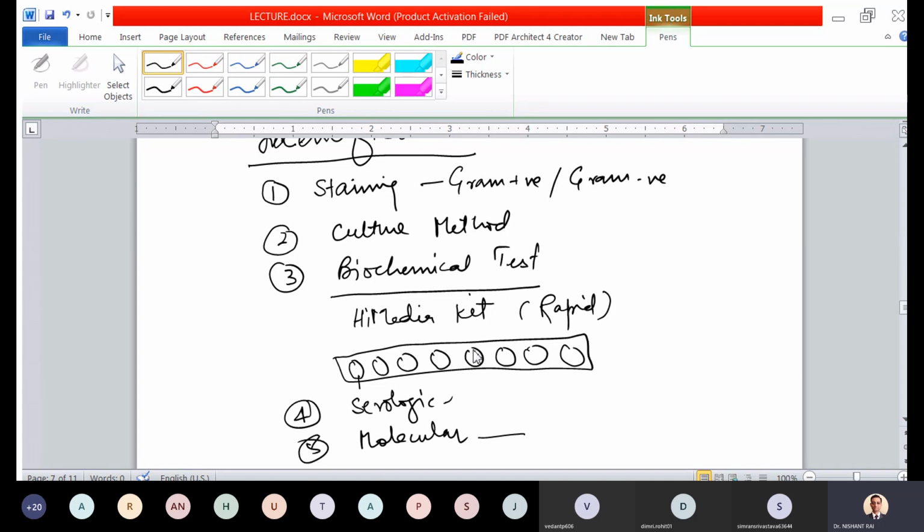अगर मैं कहूँ कि ग्रोथ को आइडेंटिफाई करें और डिफाइन करें या डिमॉन्स्ट्रेट करें, आप बताइए कि ग्रोथ हो रही है नहीं हो रही. आप सैंपल को लेंगे, इसको इनोकुलेट करेंगे, इंक्यूबेट करेंगे, राइट? और उसका ग्रो करेंगे. अब आप ये देखेंगे क्या बैक्टीरिया ग्रो कर रहा है, यानी कि बैक्टीरिया वायबल है. और फिर नंबर ऑफ कॉलोनीज कितनी है. तो दिस इज बेसिकली इनडायरेक्ट मेथड ऑफ काउंटिंग नंबर ऑफ cells. If it is asked direct counting or direct measurement, then we follow the slide methods.